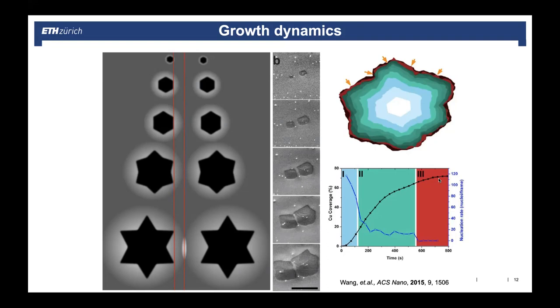But it's very difficult in copper to get a continuous film. People manage it now because they mix copper, for example, with nickel. Nickel is also catalytically active. You couple nickel alloys and then you can nicely grow. And also people have done some tricks where they have a substrate on which they want to grow and they just wrap a copper foil around.